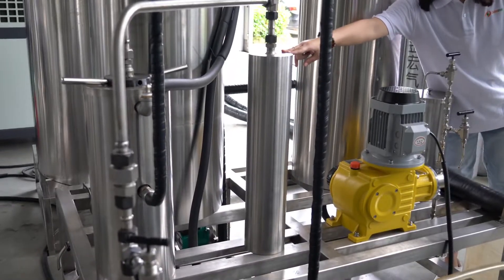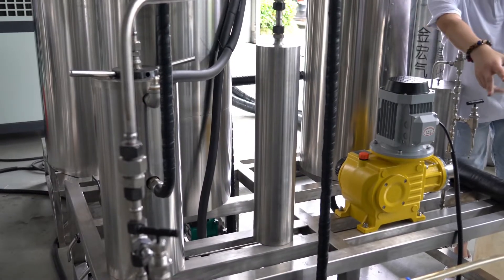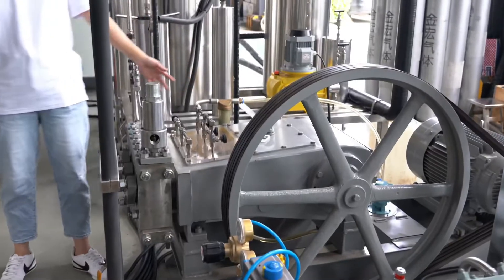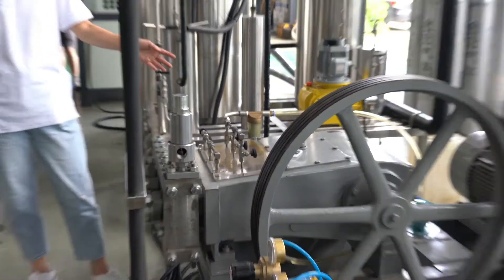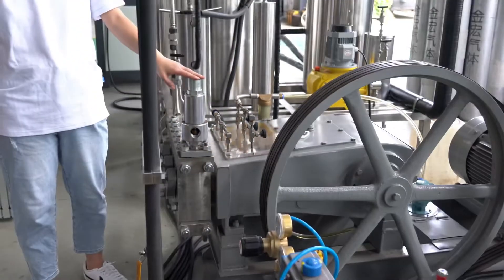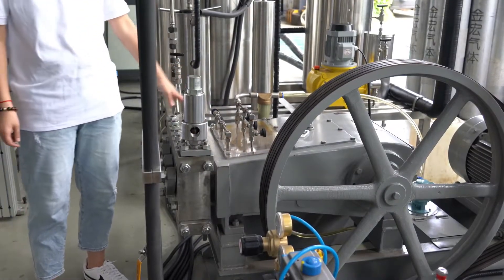This is the carbon dioxide high pressure pump. It can transport carbon dioxide into the whole system. It has five advantages. Firstly, there are three plunger rods made of ceramic material, which are all very durable. Secondly, the pump can raise pressure rapidly.